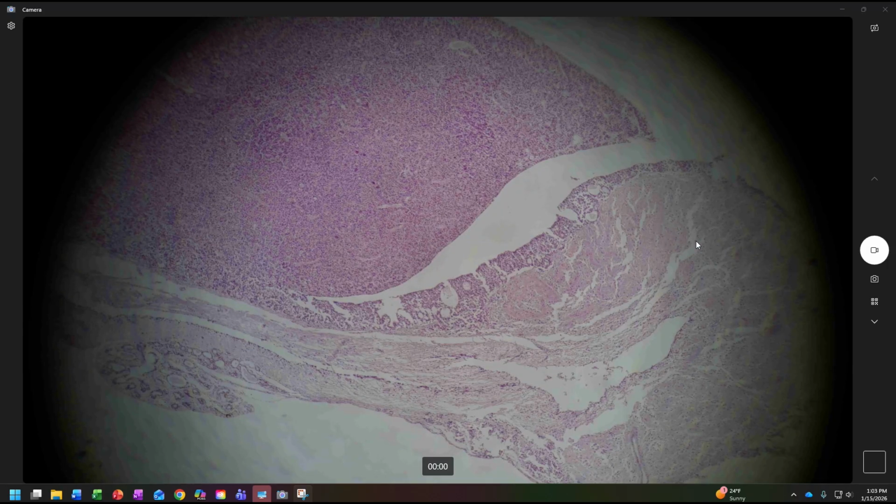Before I continue, I want you to take a moment and figure out which is which. What is this area? What is this area? Which one is anterior? Which one's posterior pituitary gland? If you need to pause, push the pause button. I'll count to about 3 or 4 in my head, and then I'll continue. I'll take a little sip of my drink.